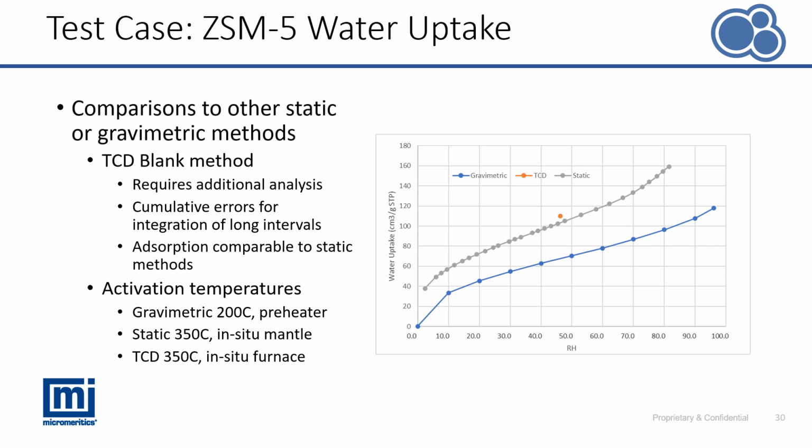The higher values reported here may be impacted by starting the sample at a drier state. The Autochem methods are comparable to the static values, and this may be an outcome of how dry the sample is prior to the measurement.